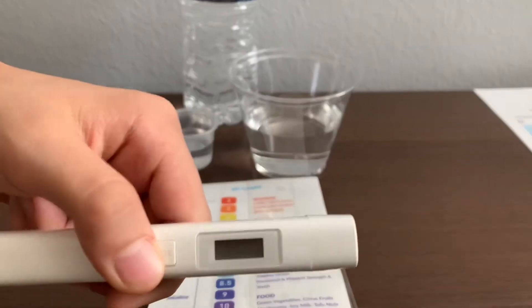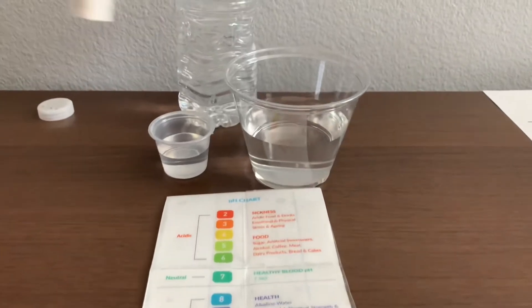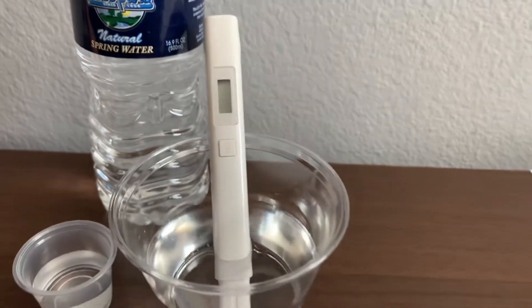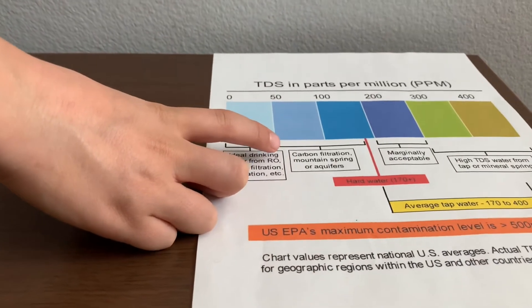Turn on the TDS tester. Make sure it says zero and put it in. Fifty-six. That is carbon-filtered mountain spring water.